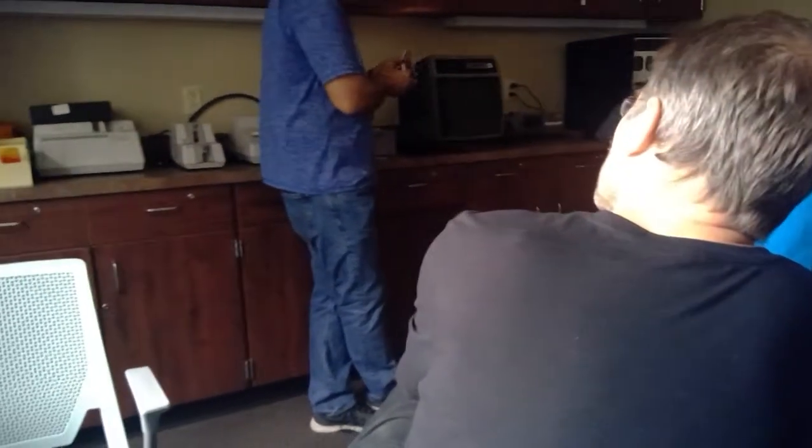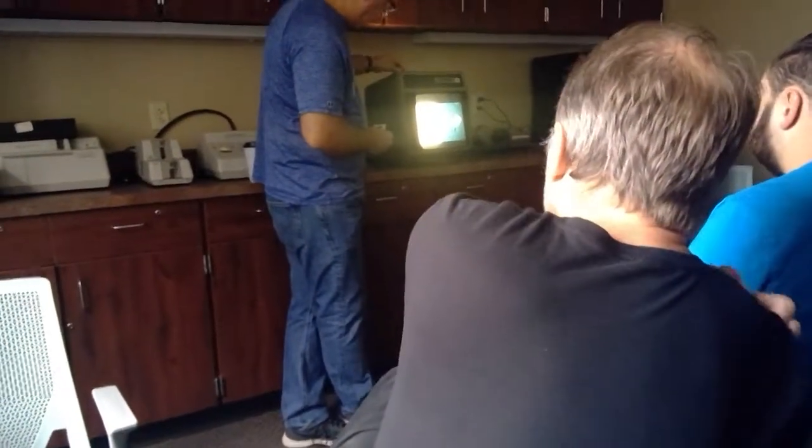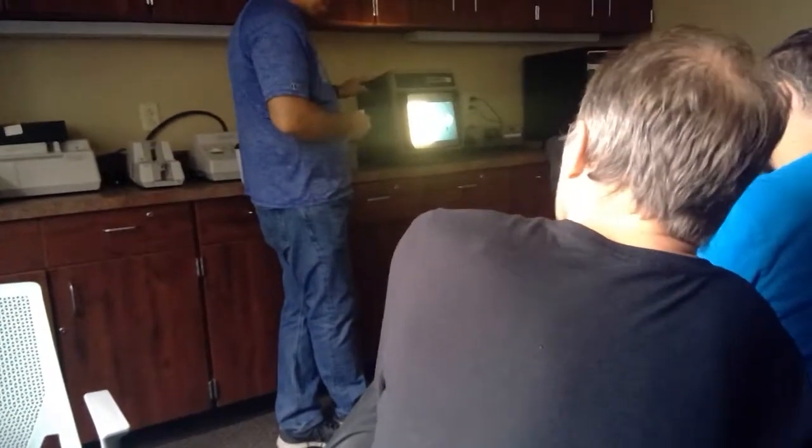I know you guys know this one, but I want to show this. The more pictures you look at, the better. And cholesterol will polarize light. That's all you're looking at.